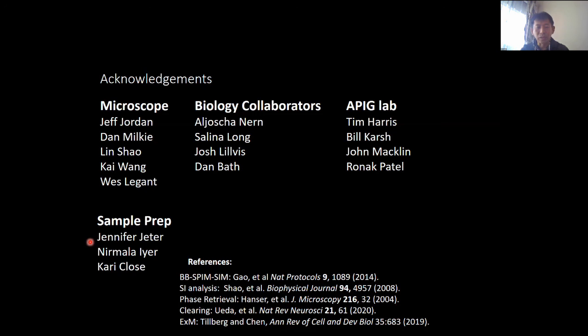So I guess going back to expansion, do you mean that if someone was to try to use confocal or a multi-photon system for expansion samples, they would have to, I guess, look at using beads as a calibrator?